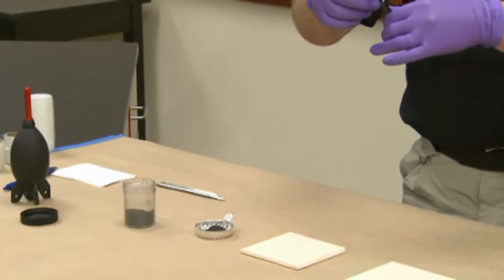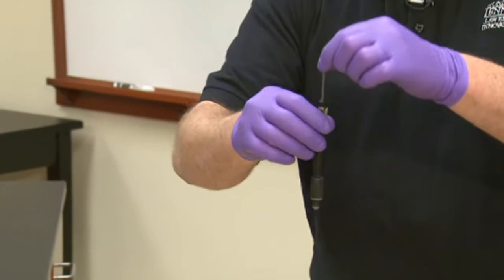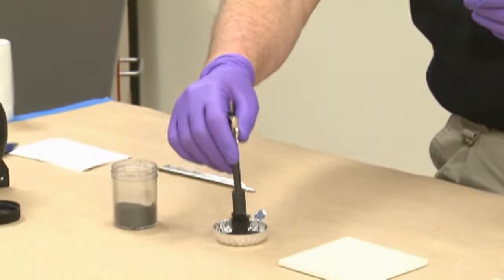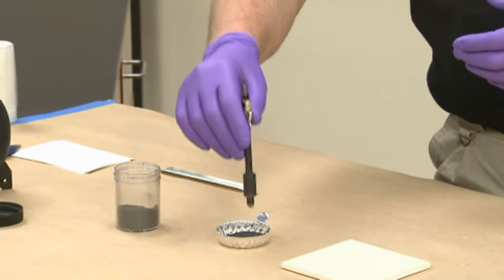With the magnetic wand, the wand has a magnet in the bottom of it. Whenever you lift it up, the magnet goes up. Whenever it's down, the magnet's down on the bottom. So you can lift it up — whenever you lift it, it drops the powder. And whenever it's down, it picks it up.